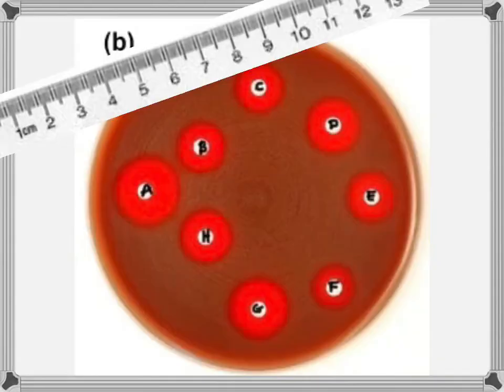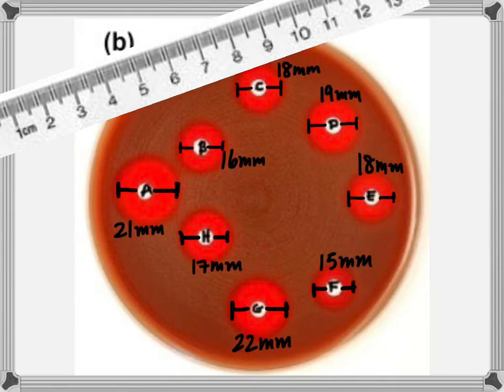Okay. So now, armed with an agar plate that has been prepared with antibiotic discs and inoculated with the bacteria, which have been allowed to grow, and of course, we've got our trusty ruler that measures in millimeters, we are ready to do some measuring. Well, it's been done for you. So the diameter of the zone of inhibition for each of these antibiotics has already been measured. Are we done? No, of course not.